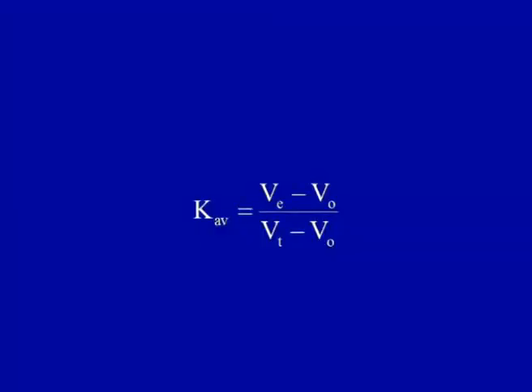So, the total bed volume can be measured by determining the elution volume of a small molecule that is not in the fractionation range, like salts or acetone. They could be utilized since they have complete access and can easily move in. They just move with the mobile phase and spend the most time, so the elution volume could be calculated by utilizing a very small molecule.